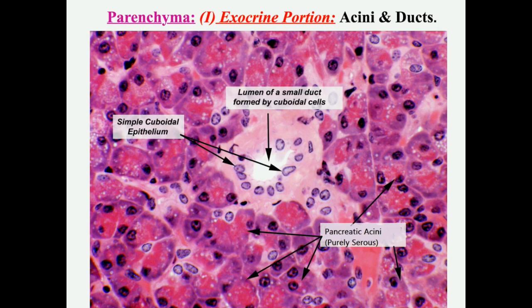The parenchyma is formed of an exocrine part consisting of acini and ducts, as well as an endocrine part which secretes insulin and glucagon. In the exocrine part, you can see the pancreatic acini, rosette-shaped, and here we have a duct. The lumen of the duct is lined by cuboidal epithelium with central rounded nuclei. The pancreatic acini are serous acini with apical acidophilic zymogen granules and basal basophilic cytoplasm.